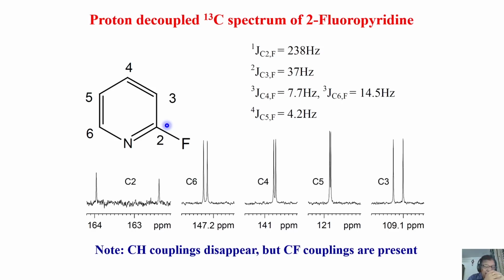But in a crowded spectrum with so many peaks, I showed you one example of cholesterol with a complex spectrum. Even after decoupling, even if you get only one peak for each of the carbons in the molecule, there can be many carbons, many peaks. Then the question of identifying whether it is a CH2 carbon, CH3 carbon or CH carbon still remains.